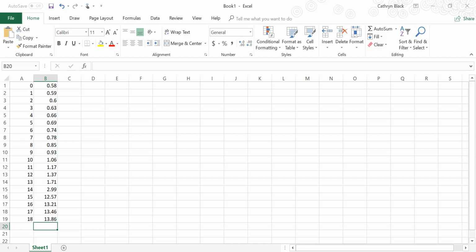Today we're going to go over how to use Excel to create a titration curve. So before we get going, we need to remember which variable is graphed on which axis. The independent variable is what is changed or controlled during the experiment. So during your experiment, you controlled the amount of base added from the burette.